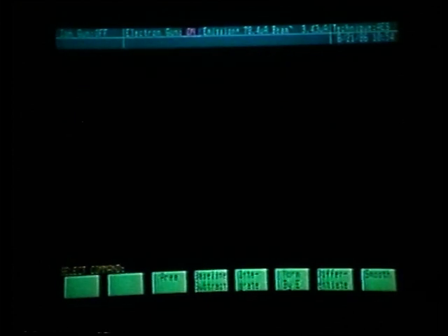We also need to get back to home bank, which is holding the shift key and pressing function key 21. To return to the suspended profile, we press soft key number 4.